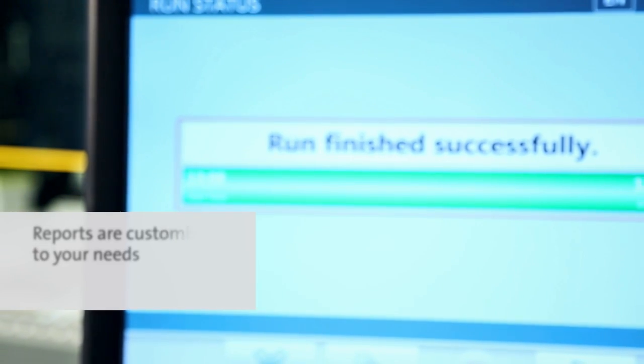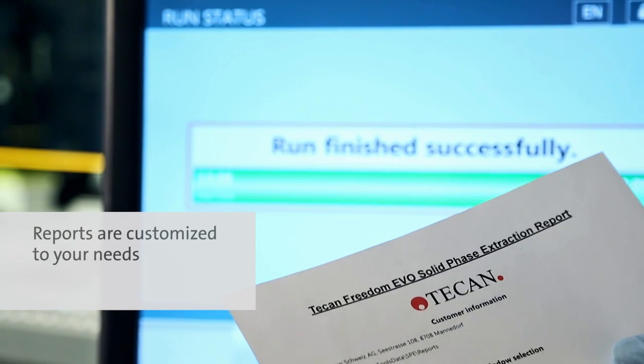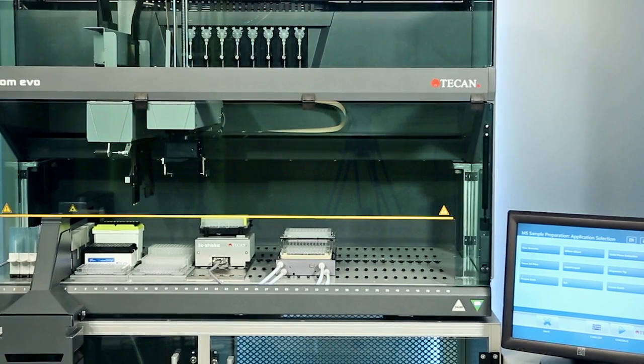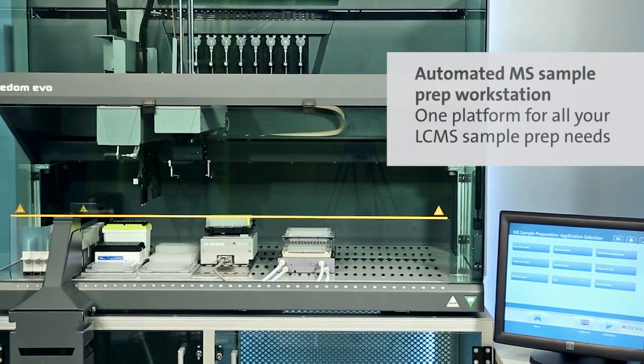At the end of your assay, TouchTools generates customized application reports, providing maximum traceability and ensuring high-quality compliance. Overcome the bottleneck of sample preparation and maximize your MS lab's productivity.